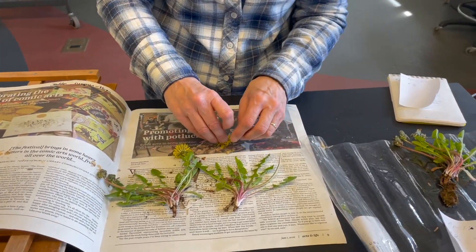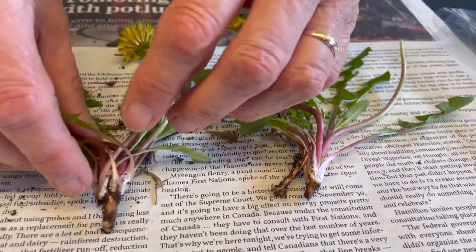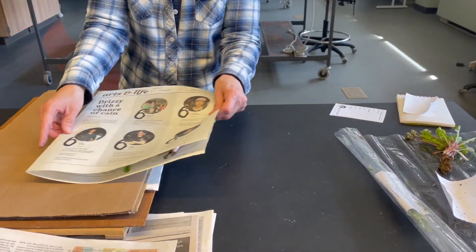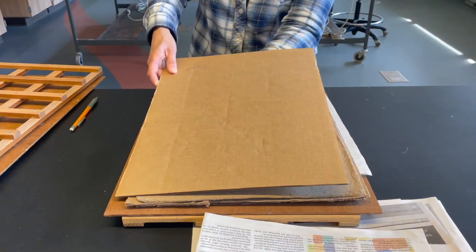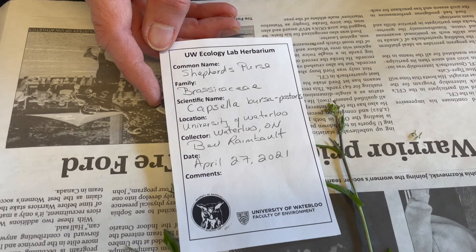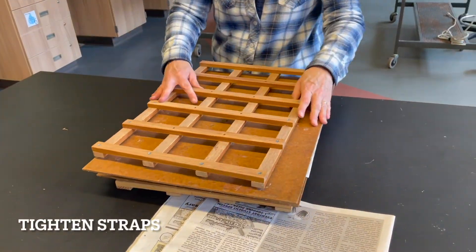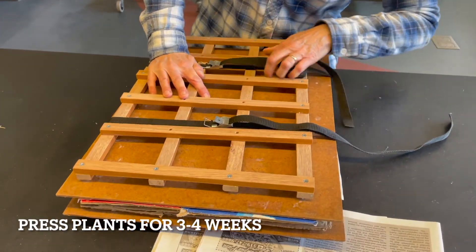Now we will prepare our next specimen. Sometimes it is helpful to remove one flower and press it separately. Make sure the leaves are spread out nicely. We will also create a label. Then we will put this plant into our press and again place a piece of blotting paper and then cardboard. Now we will unroll our roll to the first plant we collected, spread it out nicely, create a label and add it to the press. When all the plants are in the press we tighten the straps of the press. Plants need to stay in the press for three to four weeks for drying before mounting.